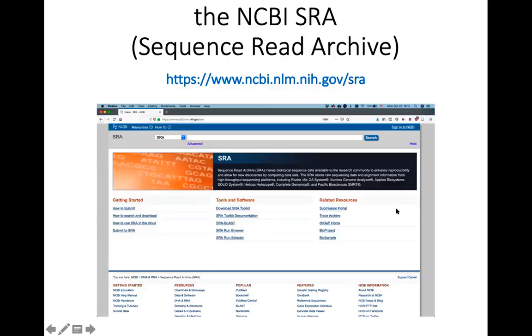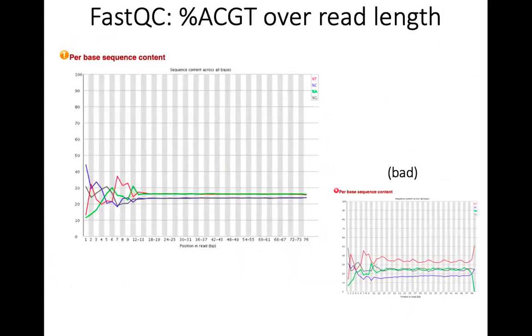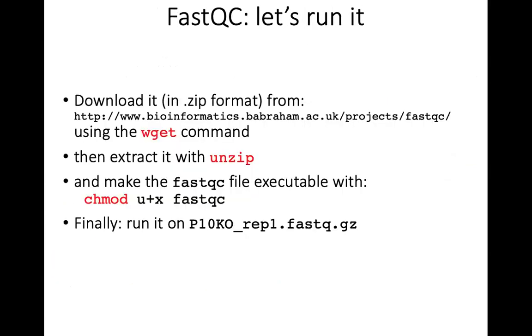Okay, so yeah, let's switch to running FastQC. Okay. Yeah. Oh yeah, and the goal for today is to do mostly just practice.